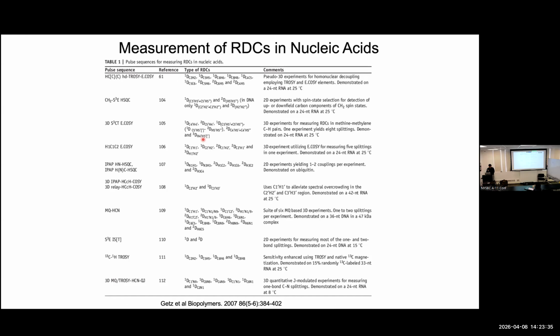Exactly. So I can control the J coupling evolution by applying a 180 pulse on the other groups and keeping the chemical shifts refocused. And you can do it in such a way that the total evolution of the J coupling is a constant time. It doesn't change as a function of the little t level. Right? And so maybe tomorrow I can give you a little example. Okay.